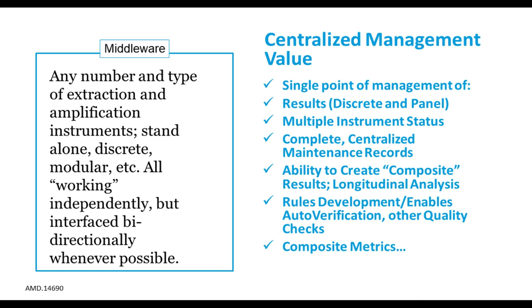The middleware is any number and type of extraction and amplification instruments, discrete, standalone, all working independently, but interfaced bidirectionally where possible. And what that's going to afford you as a user, and this isn't meant to be exhaustive, it's really proportional to your imagination, because the contemporary middleware systems out there are really capable of almost any kind of data merging and extraction, but it's really meant to provide a single point of management for results, both results that are discrete or panel results.